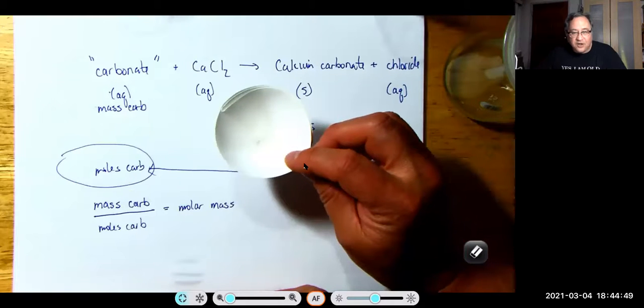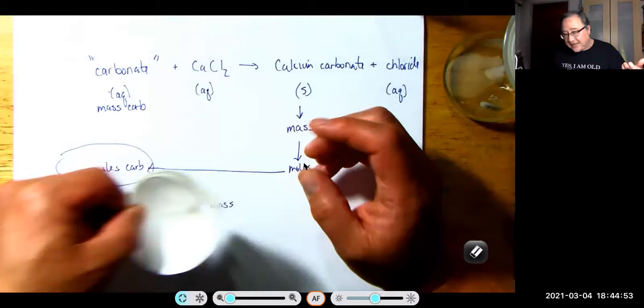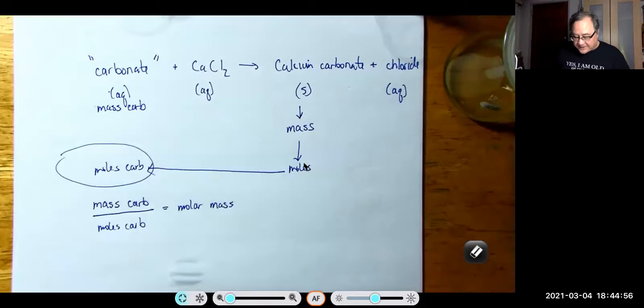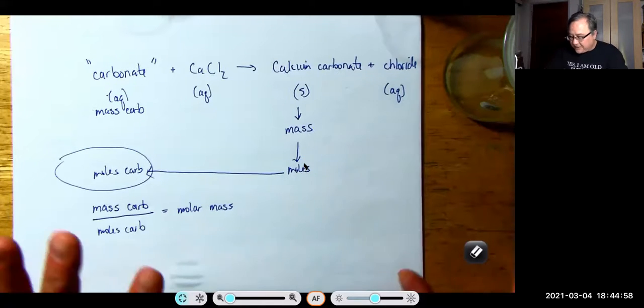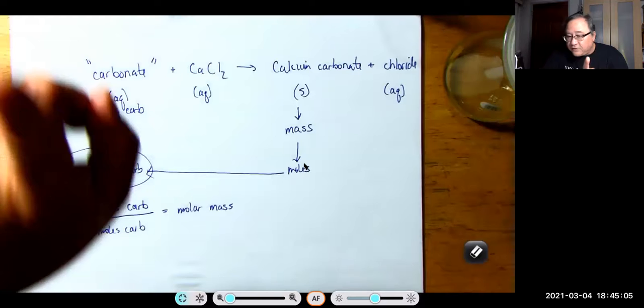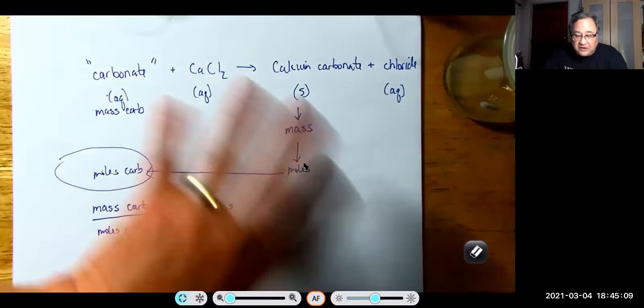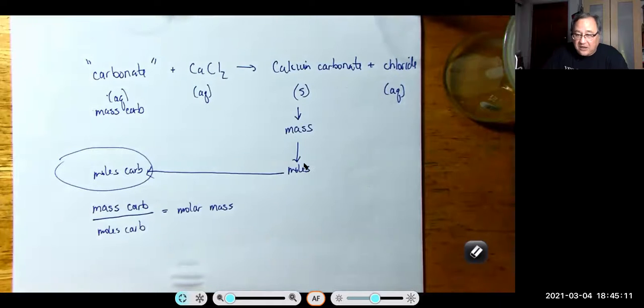Now, I'm not saying throw dust in your material. I'm saying throw dust on the balance to see how much it weighs. And I think you'll find out that even though you have some cloudy material, it's not going to be a big deal. But the thing you do need to worry about is if when you filter, it's really cloudy and you can't see through the solution at all, you lost a lot of solid. And there I would be concerned.